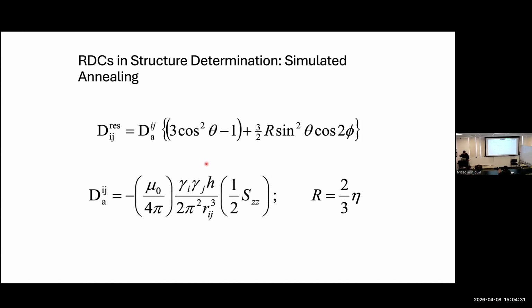Right, the magnitude of the interaction, and how much it varies from one angle to the next. When I rotate the sample, I'm sweeping different magnitudes of the interactions, and I need to spin faster than the difference of these interactions to average them out.